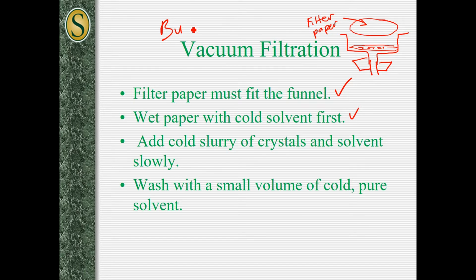This Buchner funnel, that's how you spell Buchner, is supported on a stopper which is on the neck of the thick-walled flask. The thick-walled flask has a vent. The vent is connected to tubing, and that goes to the vacuum.